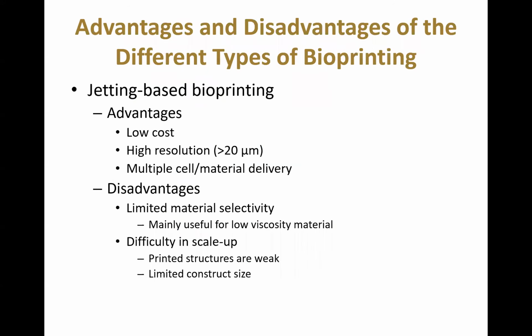Some advantages and disadvantages of each of these types of bioprinting are given in the next few slides. And here you can see the advantages of jetting-based bioprinting is that it's fairly low cost. You can get high resolution using jetting-based bioprinting.